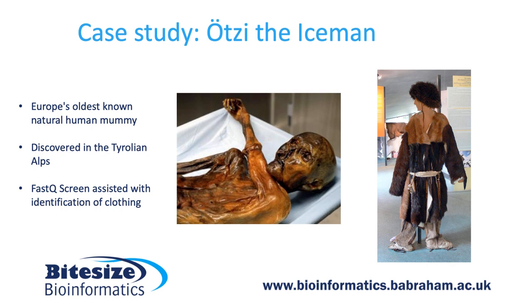In my second interesting example of how FastQ Screen has been used outside the Institute, I wanted to talk about the case of Ötzi the Iceman. Now, Ötzi was discovered in 1991 in the Tyrolean Alps by a group of tourists. When they first discovered his body, they believed, due to the fact he was relatively very well preserved, that he was a recently deceased mountaineer.